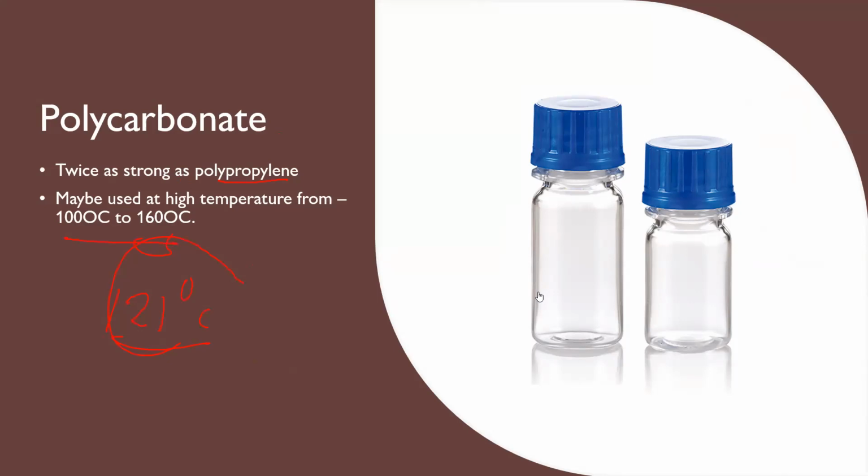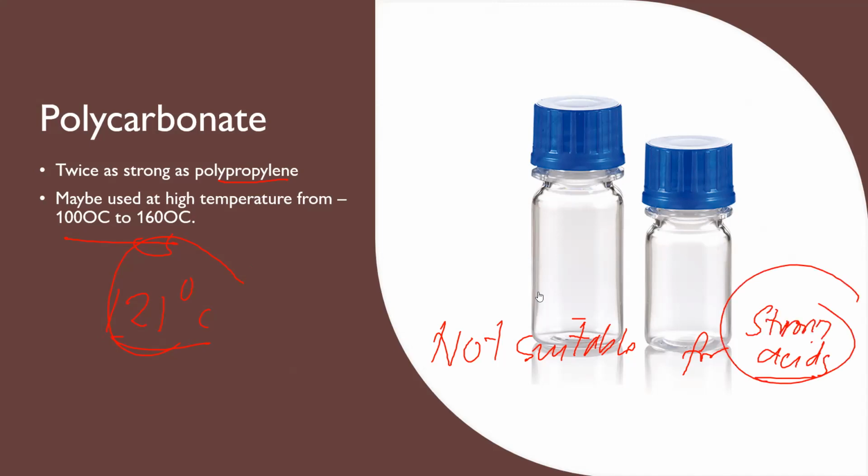However, your polycarbonate is not suitable for acids, bases and oxidizing agents. Take note, not suitable for acids, particularly strong acids. By the way, what do we mean by strong acid? How can we know that an acid is a strong acid? And how can we know if an acid is a weak acid?